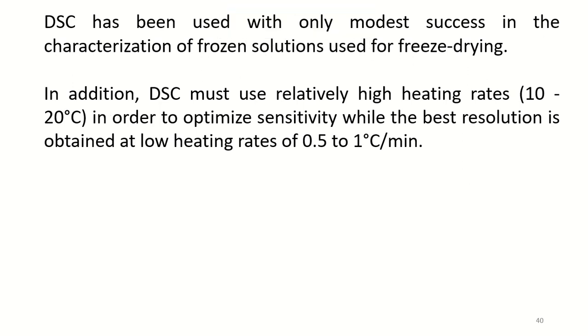The combination of two heating rates allows the operator to select a slow average heating rate in order to obtain good resolution and a higher modulated heating rate to obtain increased sensitivity during the whole experiment.